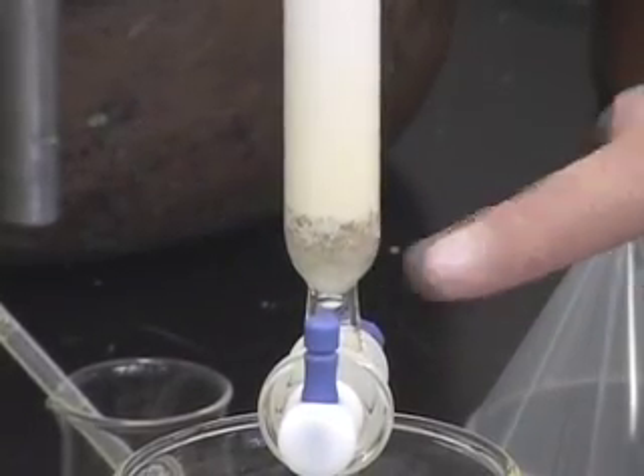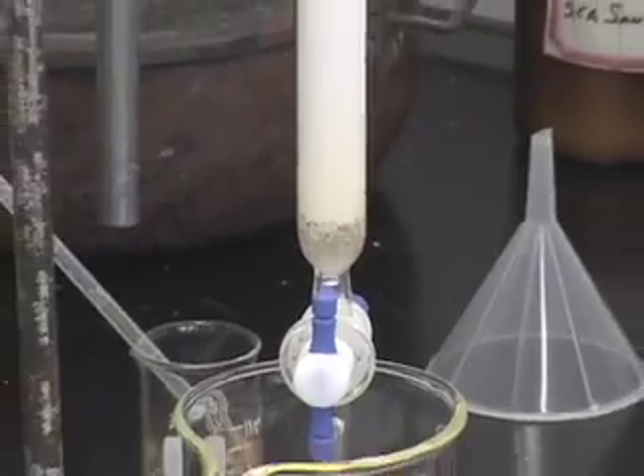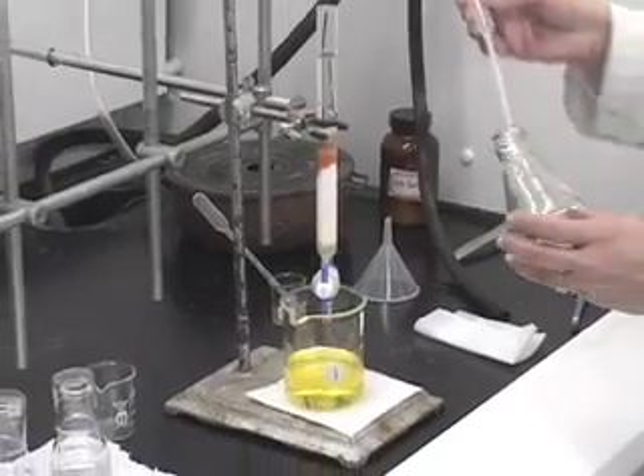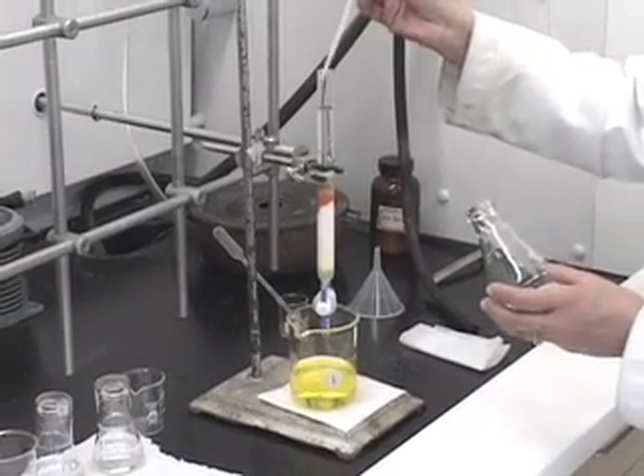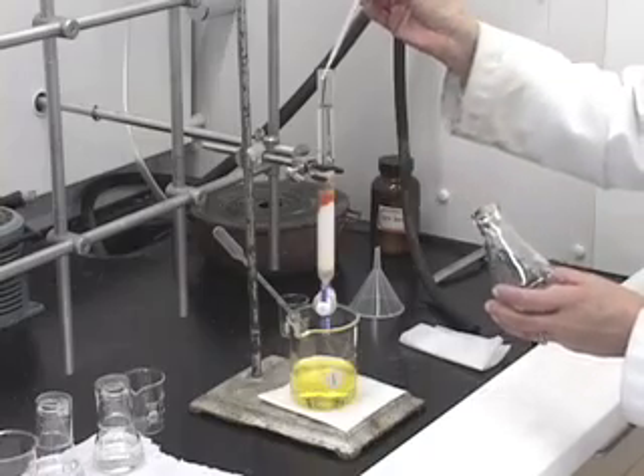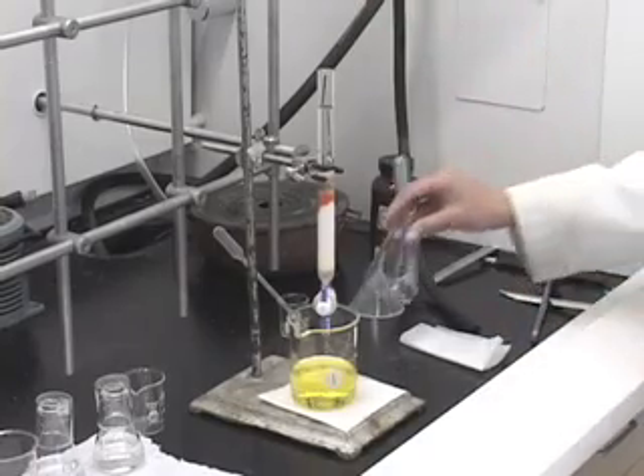At that time the glass wool will look really white, like it did when we began to do the separation. So as soon as the yellow disappears, we can change to the intermediate beaker, and we also change the polarity of the solvent.